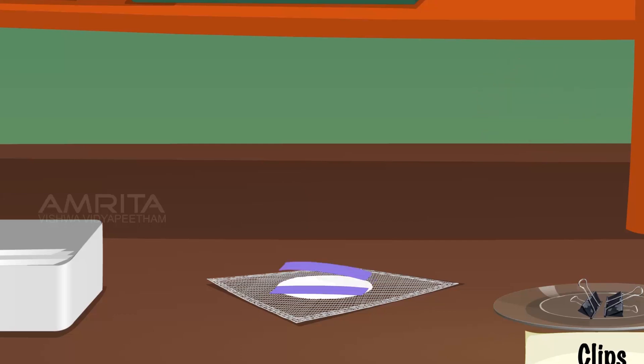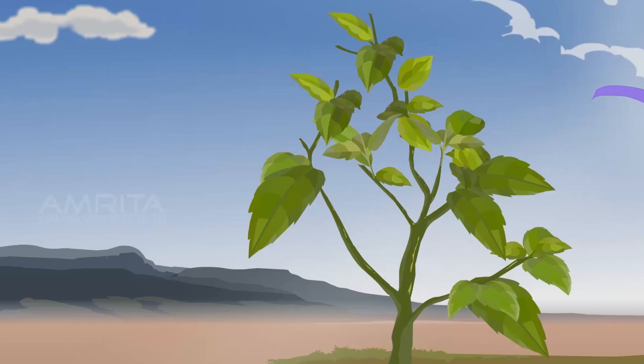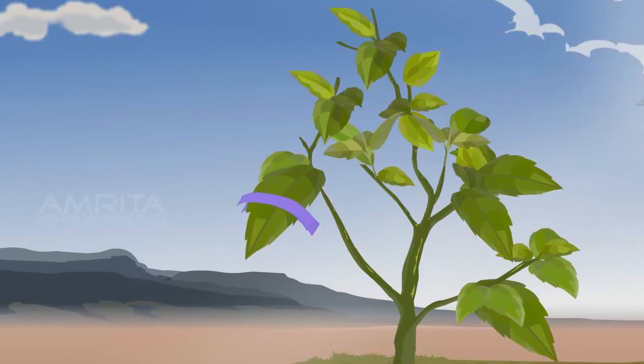Take the dry strips of cobalt chloride paper from the wire gauze. Select one healthy leaf from a potted plant. Place a dried strip of cobalt chloride paper on the upper and lower surface of the selected leaf.